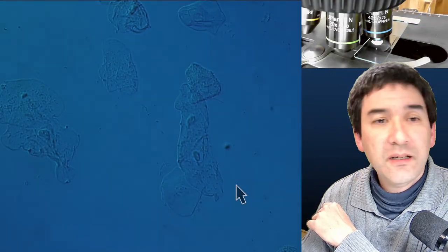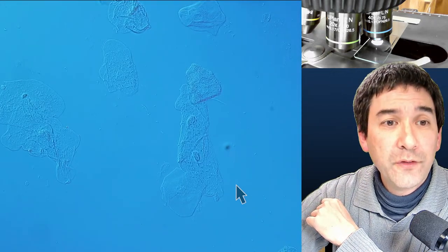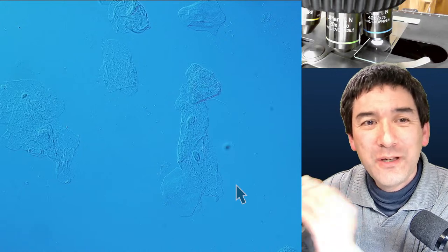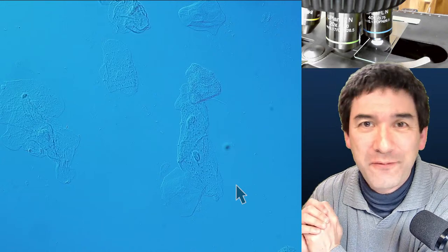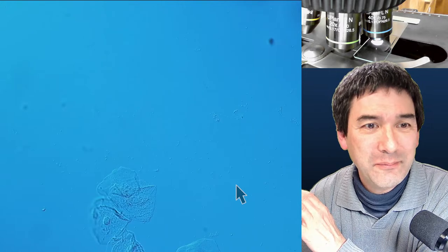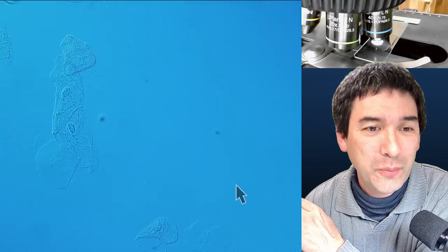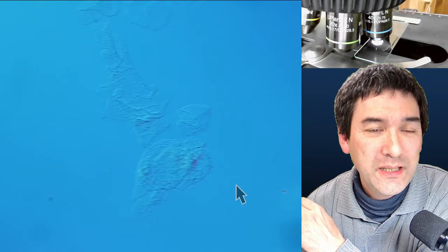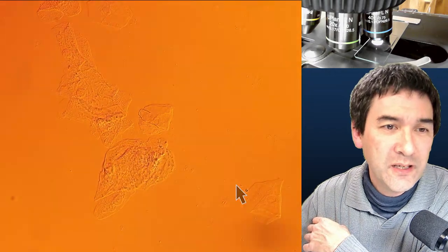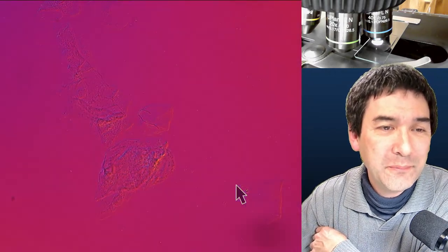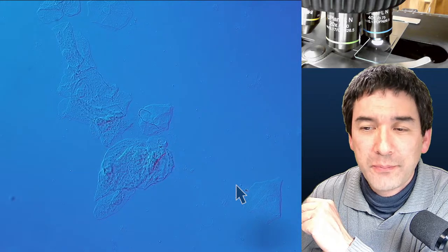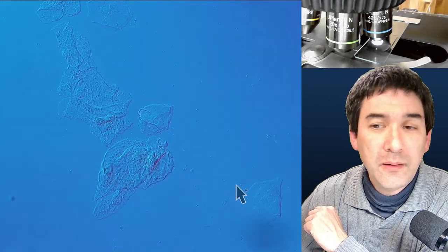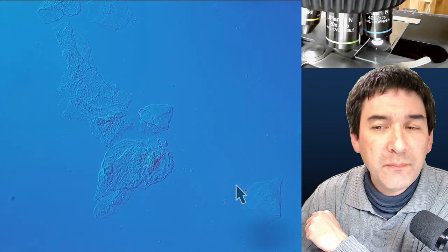This is how the cheek cells look in DIC differential interference contrast — it gives a somewhat three-dimensional appearance. The contrast isn't quite as high as in phase contrast for these cells. The reason I often use DIC is because you can change the colors and produce that pseudo-3D effect. I'm going back to phase contrast now since that's the focus of today's stream.